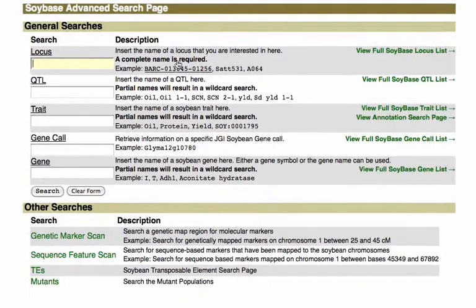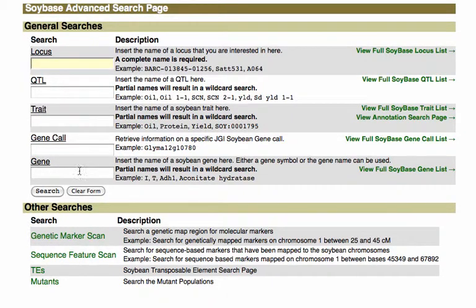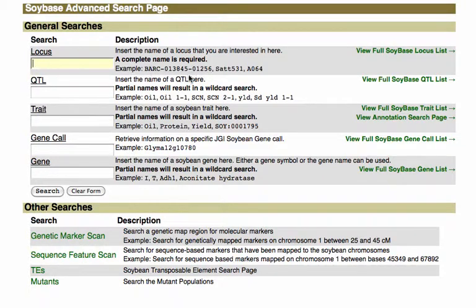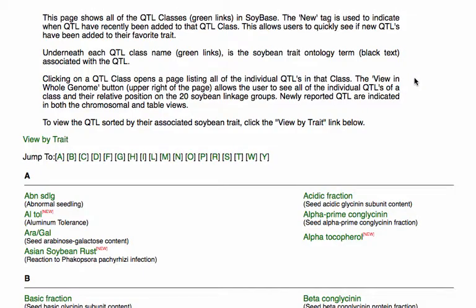At this page, you can search for Loci, QTL, Traits, Gene Calls, and Genes by names or partial names. But what we're interested in is to get a full list of all the QTLs in SoyBase. You see this link here, and if you click it, it'll take you to a list of all the QTLs in SoyBase.